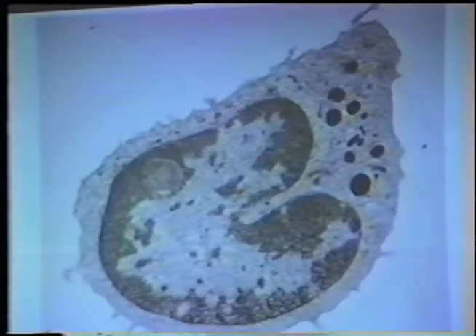Now, when freezing is really good, most areas are really nice. Then as the freezing quality goes down, more and more poorly preserved areas appear laterally. And then you'll finally reach the point where you do begin to get poor preservation with depth. I have no good explanation for that. It's simply an empirical observation.